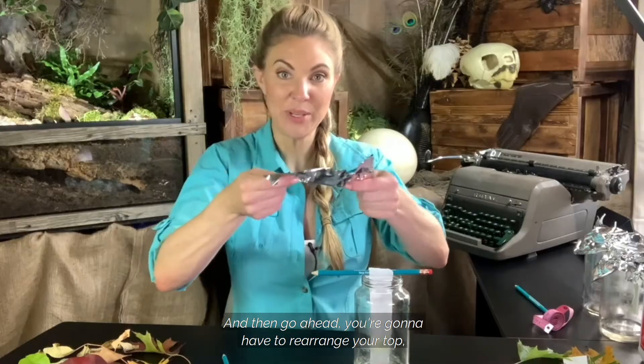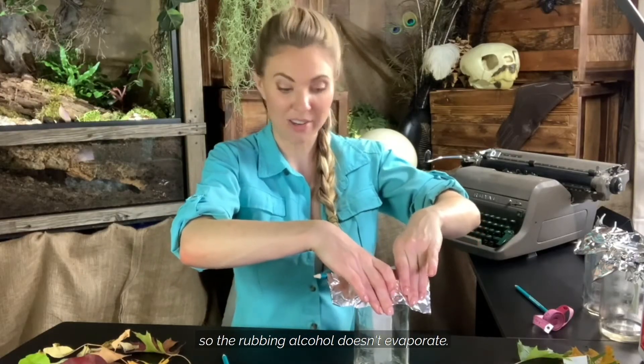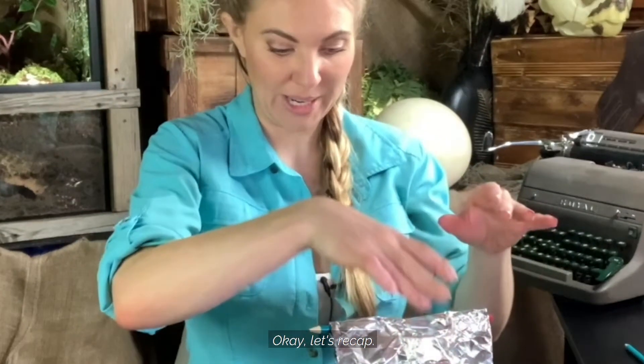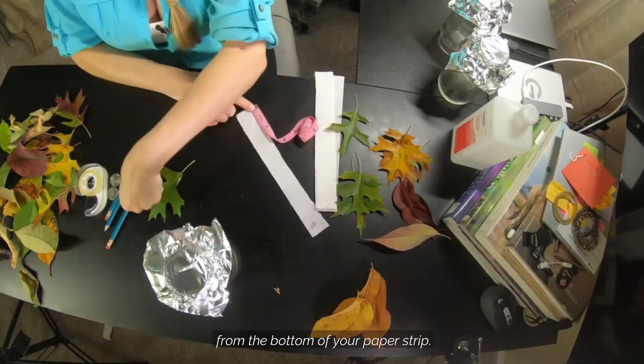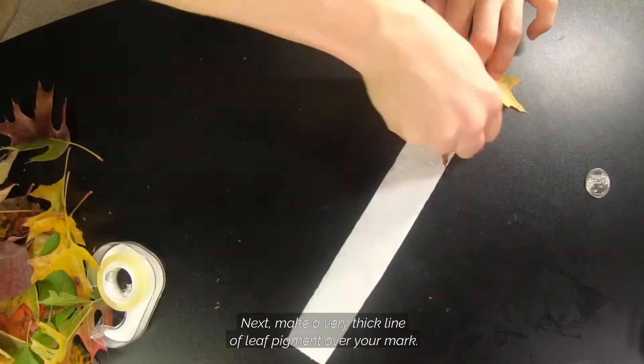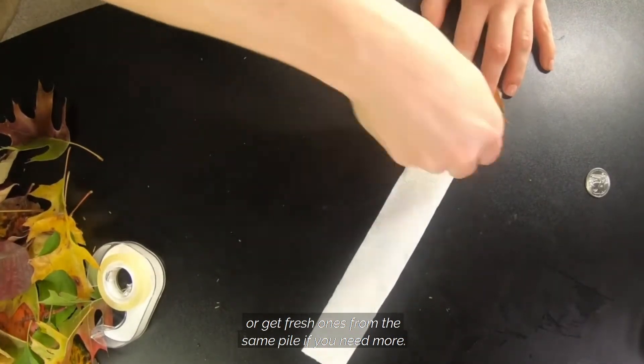Go ahead — you'll have to rearrange your top, but put the lid back on so the rubbing alcohol doesn't evaporate. Let's recap. First, mark a one inch line from the bottom of your paper strip. Next, make a very thick line of leaf pigment over your mark. Remember to move the leaf around or get fresh ones from the same pile if you need more.